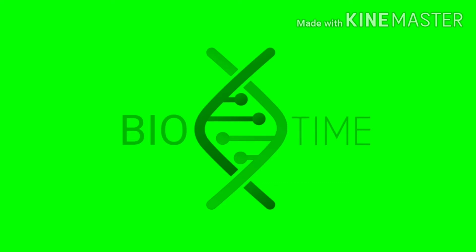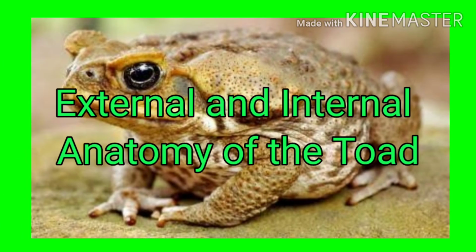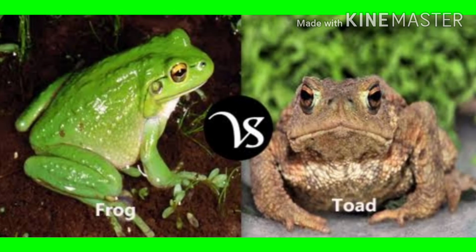Welcome to BioTime. In this video, we will be studying the external and internal anatomy of the toad and their functions. First, let's get to know more about toads and how they differ from frogs.